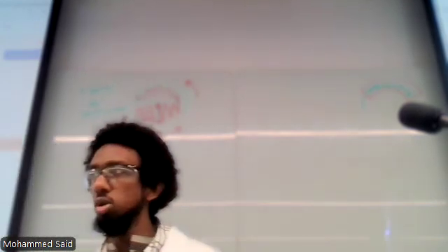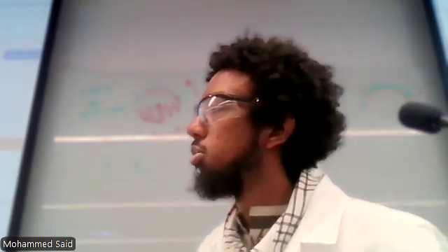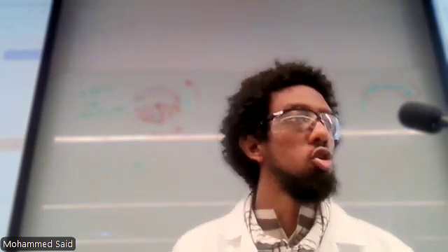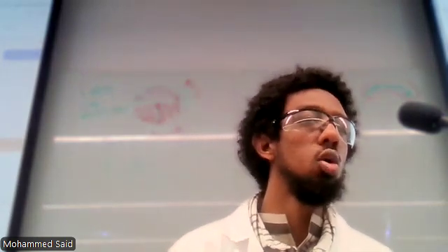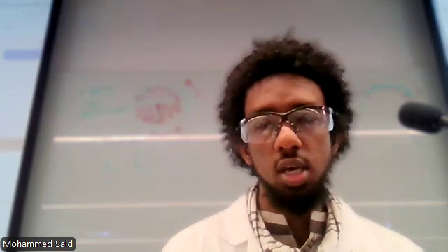Does anyone have extra E. coli? If your group has extra E. coli, please raise your hands. I would just go with any remaining, and then it should be okay. If any other groups have additional E. coli for exercise 2, please give it to group 6. Thanks a lot.